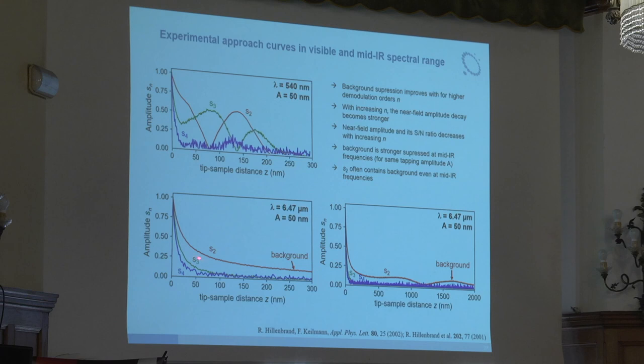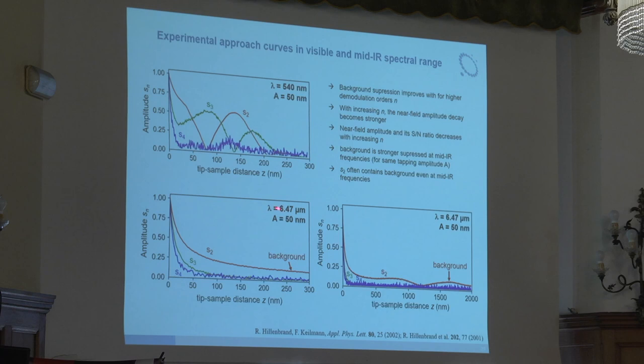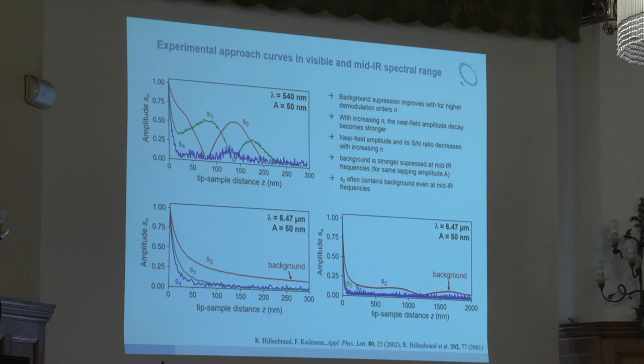Nevertheless, if you look at the second harmonic, and this was done, I think, on silicon or gold, at a standard tapping amplitude, the second harmonic is not necessarily background-free. So be careful. Using the second harmonic is tricky. Check carefully whether you can do that.